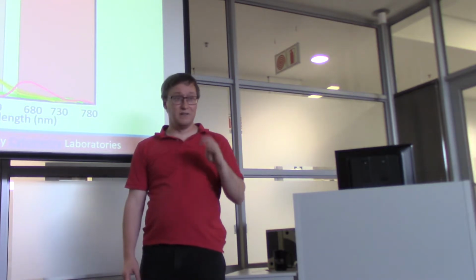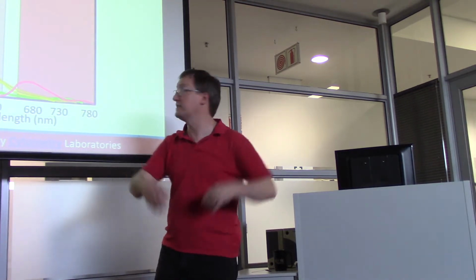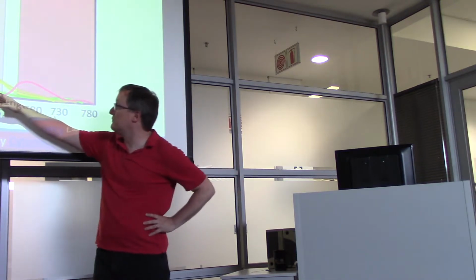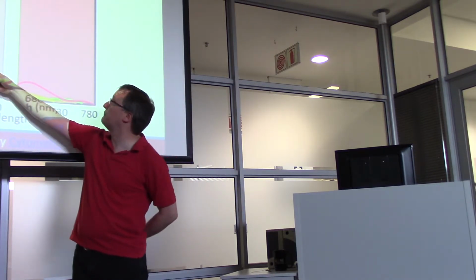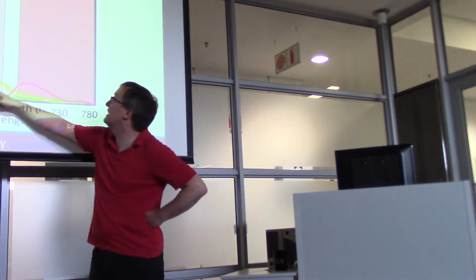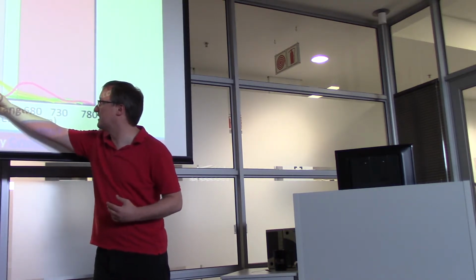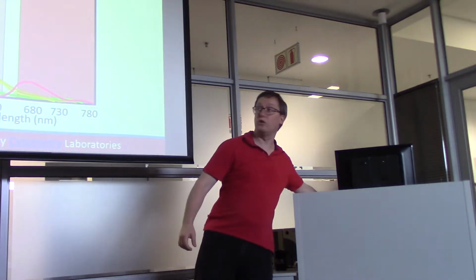Now, if you are using multiple colors, multiple lasers all shining on this sample to get these fluorescent activities out of them, you're probably going to run into this problem that we spoke about with the fluorescence microscopy, that the emission wavelengths of these different dyes can overlap. So if you have a lot of PE dye, a lot of emission coming from that, it could potentially mask this yellow dye, the PE-TR dye. So that would be problematic. We need to be able to adjust how much intensity we're seeing at these levels to pull out the contribution from PE. And that's a problem we're going to call compensation in a minute.